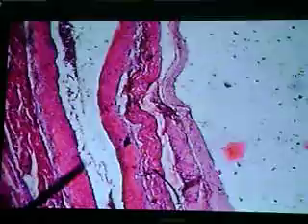You're right. But I think I'm seeing more things right here. I got carried away and thought it was a nerve traveling with it, but this seems to be one of the major arteries, one of the main coronary arteries that we're looking at.